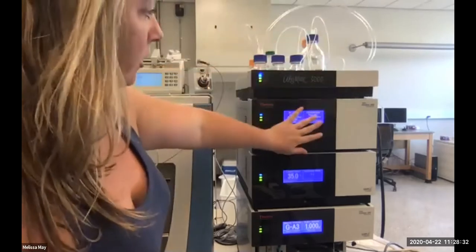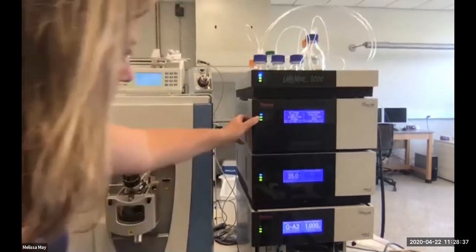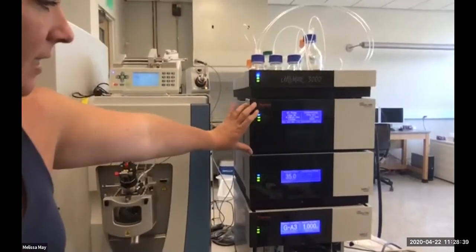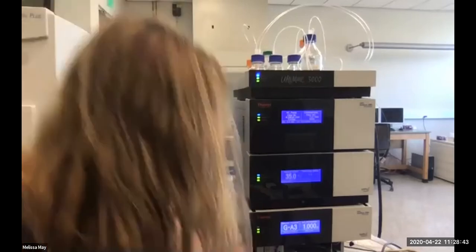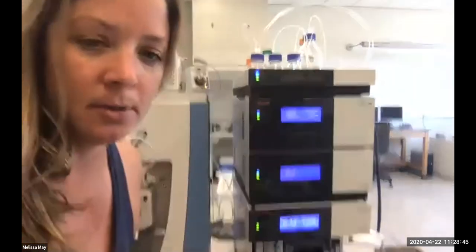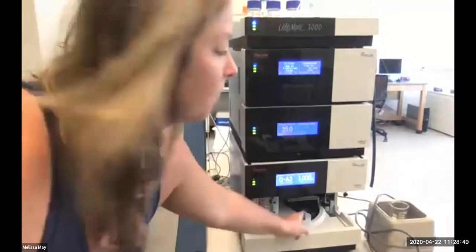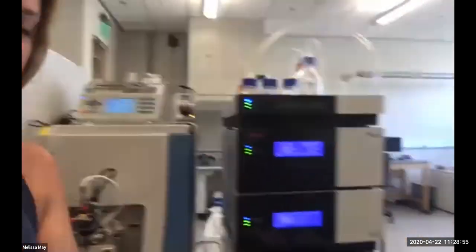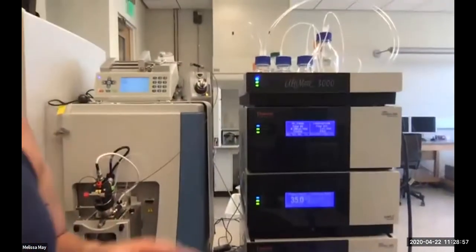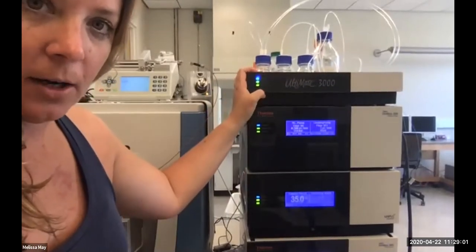And then others just go straight into the pump module. So the pump module is here. This is our column chamber, and this is where we have our auto sampler, and the samples sit down in this bottom portion. So to talk you through some of the components, let's try to get this a little bit closer.